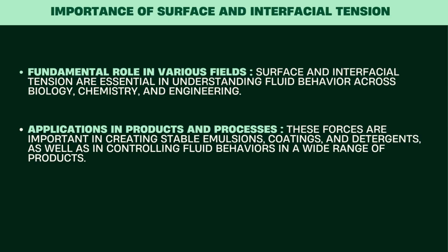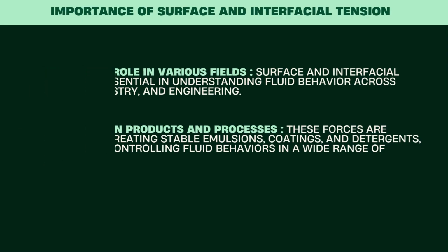Importance of surface and interfacial tension. Surface and interfacial tension are essential in understanding fluid behavior across biology, chemistry, and engineering. They are important in creating stable emulsions, coatings, and detergents, as well as in controlling fluid behavior in a wide range of products.